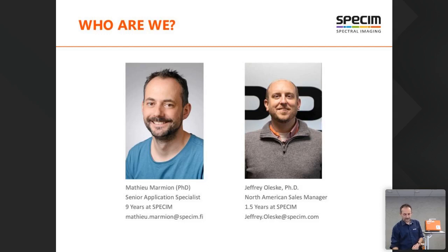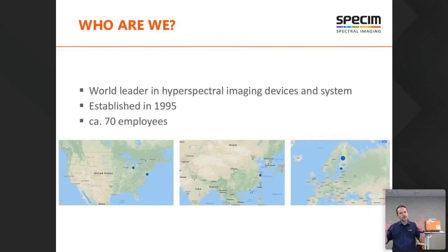Okay. So then we will start to go with a general presentation about Specim. Just for your information, remember that already this year we held 2 Q&A sessions. You could see them on YouTube, and there I explain also who we are and different types of applications. The first webinar was dedicated to the food industry. The second one was dedicated to waste recycling. This one is dedicated to the FX50.